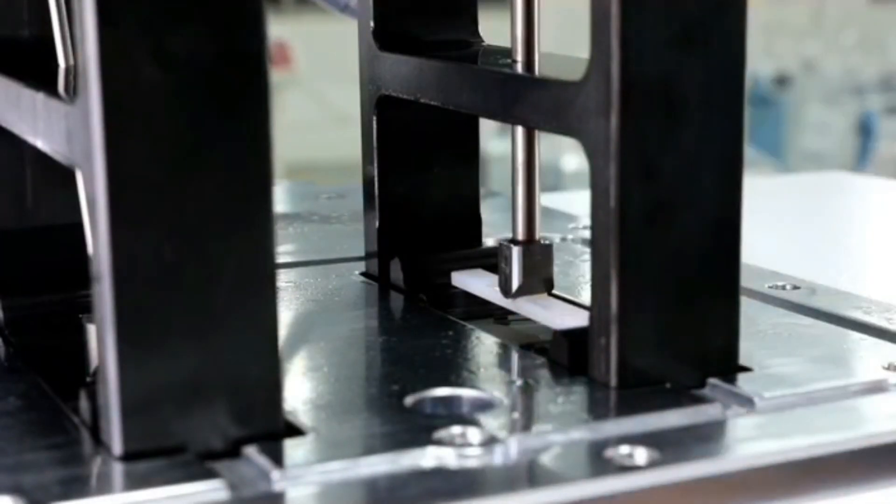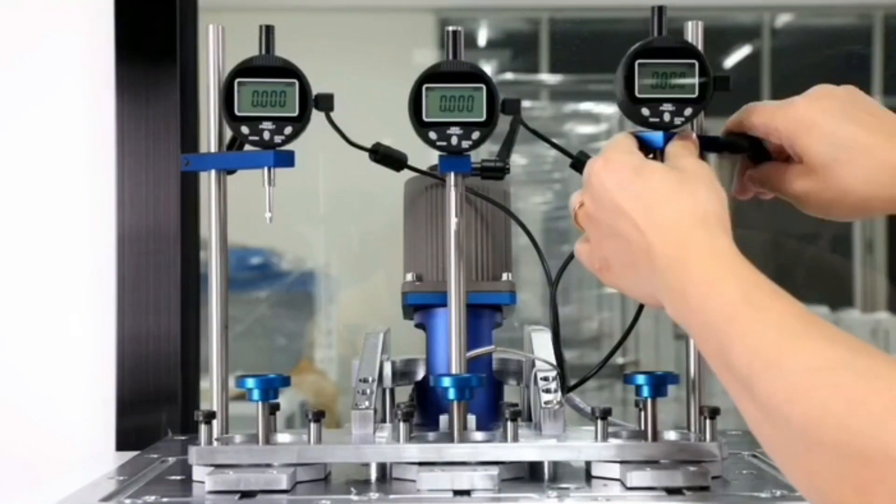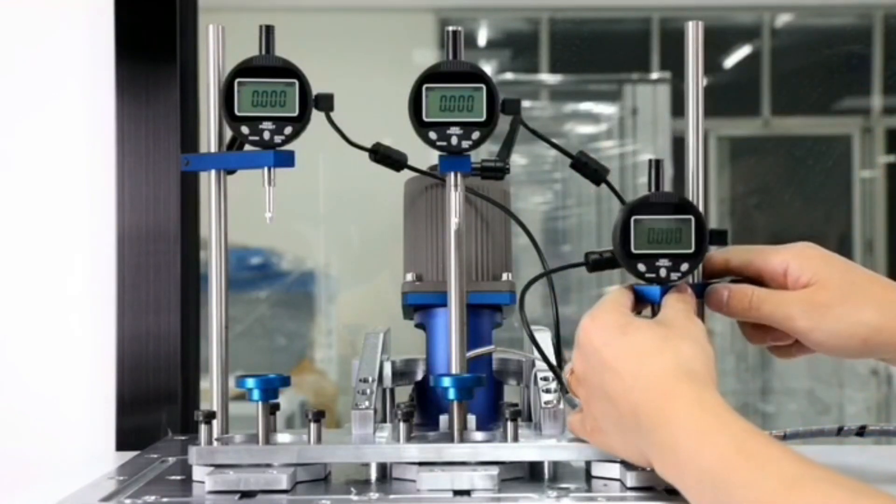The test principle is heated with heating wires through the methyl-silicon oil thermal conductivity to achieve the purpose of heat deformation of the material.